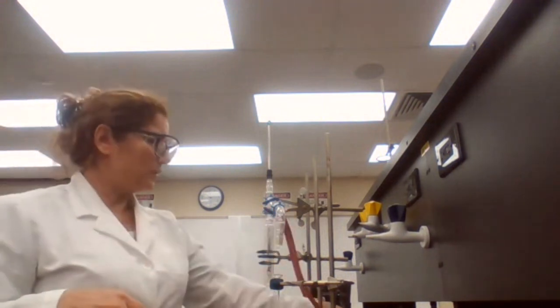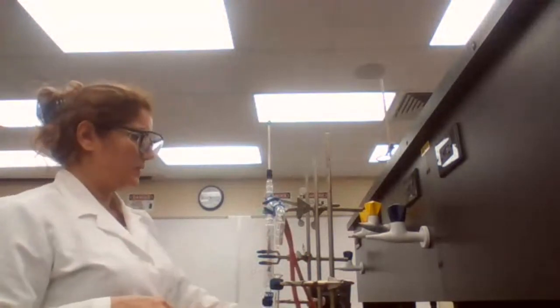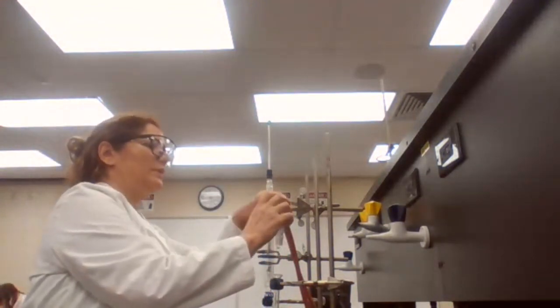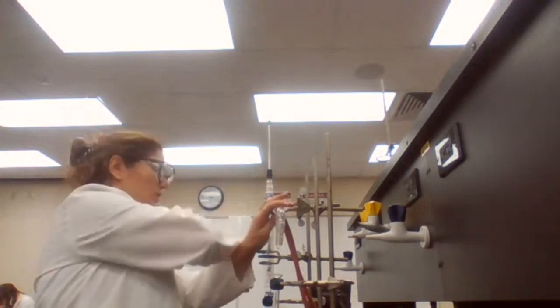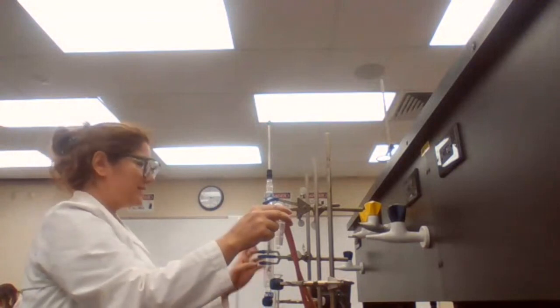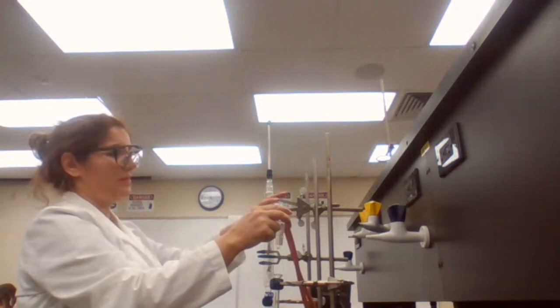You disconnect the hose from the faucet, from the lower end. The water drains out. Now the condenser is empty. There is no more drop coming out. We are going to start deassembling from the cold end to the hot, because when we started, we went from hot to cold. First the flask, then the fractionating column, distillation head, condenser.